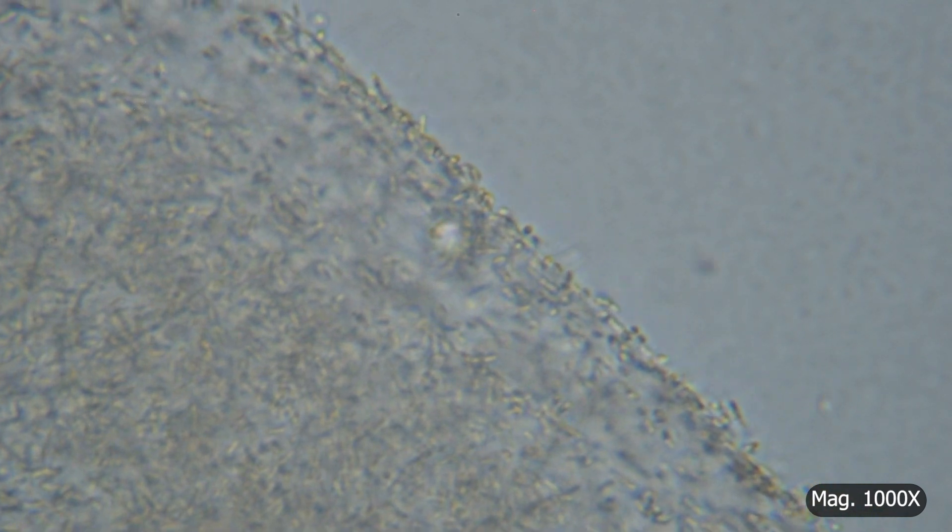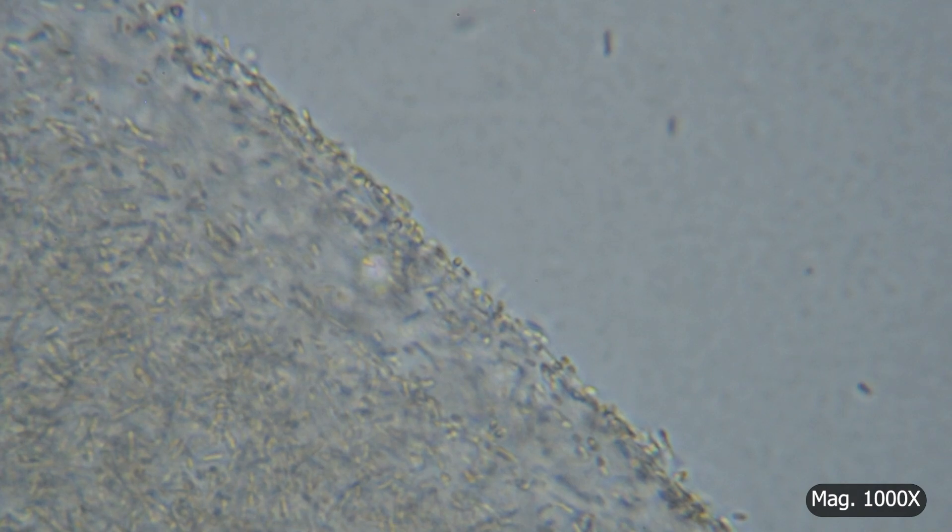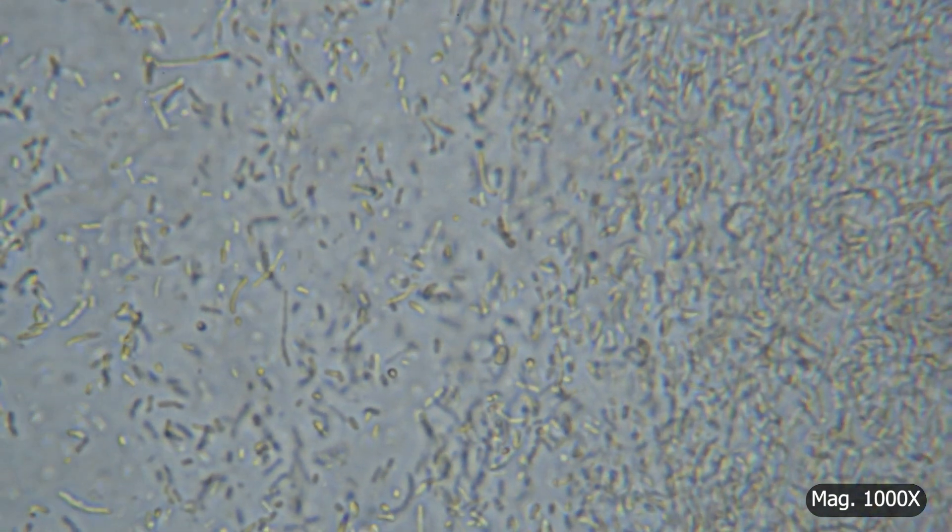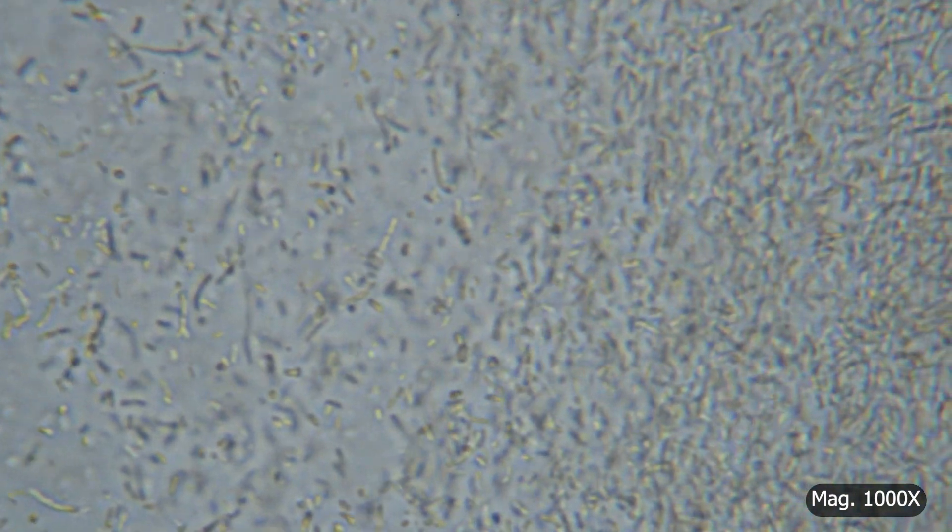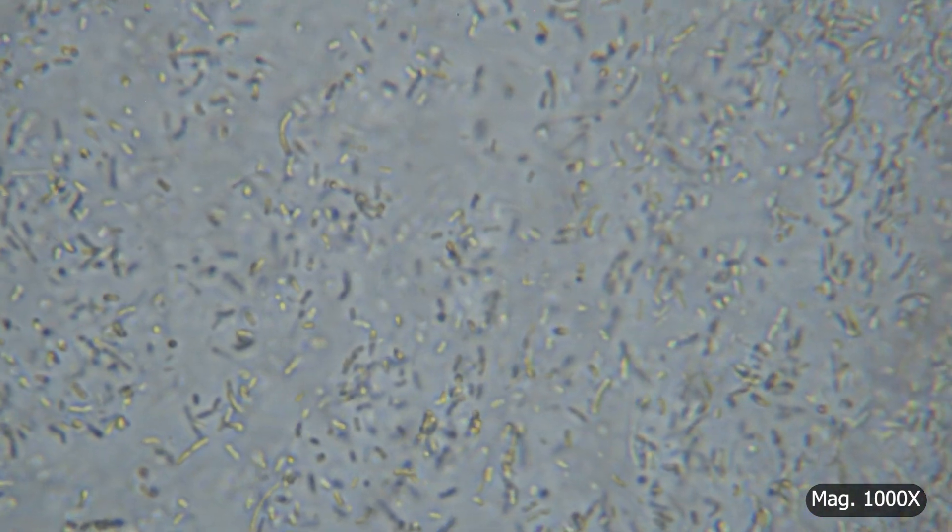Bacteria in the mother moved around, but were bound by something invisible to the microscope. The invisible bindings were made of cellulose. I was able to demonstrate the presence of cellulose, even though it was not visible on my microscope.